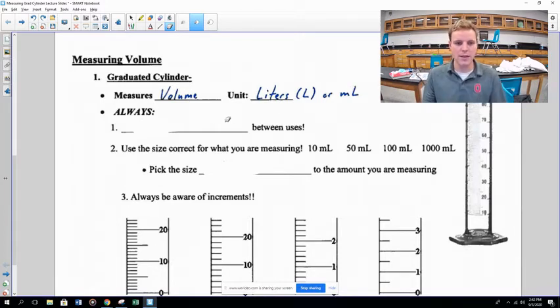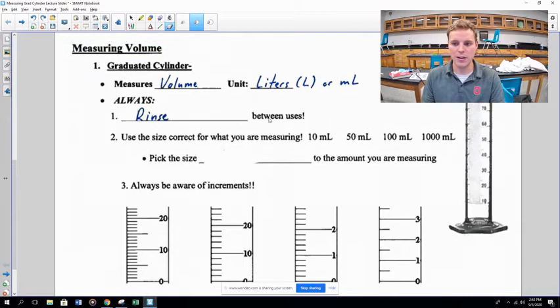One important rule: always rinse your graduated cylinder between uses. If you measure chemical A and then measure chemical B right after without rinsing, A and B could react inside the graduated cylinder. So after measuring chemical A, rinse, rinse, rinse — that way the two chemicals don't mix in the cylinder.